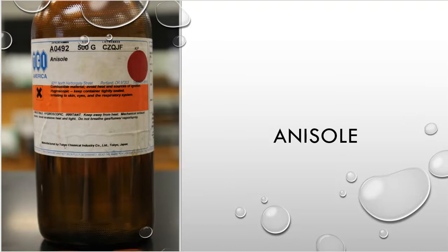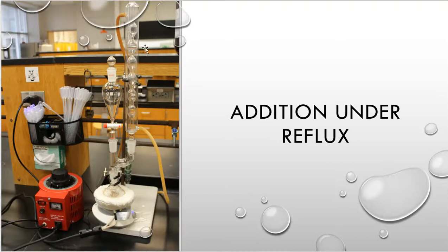The lab directions are also going to tell me to perform this addition under reflux. And this is basically what that setup is going to look like. What I have here to the left-hand side of the picture is our variac. And our variac, if you have not taken Orgo 1 with me, or if you've forgotten what the variac was for, is just the stovetop dial of the laboratory heating mantle. So this is going to allow me to control how much heat is going to go to the mantle, and I'm going to plug that box up into the outlet, and you see that here, and I'll just turn the knob. The higher it goes, the more energy that's getting shot through, and the hotter that heating mantle is going to become. If I don't want it that hot, I turn the knob down. So again, think of it as the dial on your actual stove. Here is the heating mantle that it controls, and notice that you can see it plugged up to the heating mantle that's down there below, or to the variac.